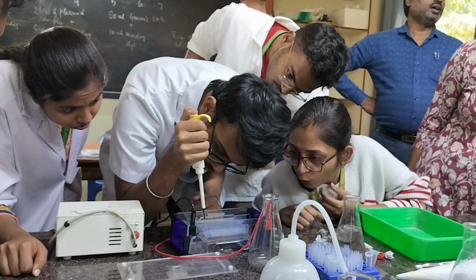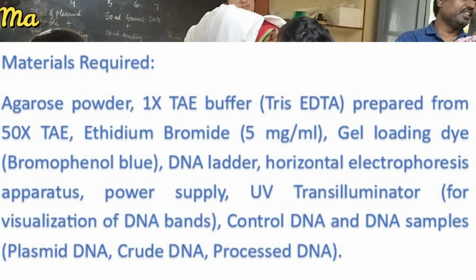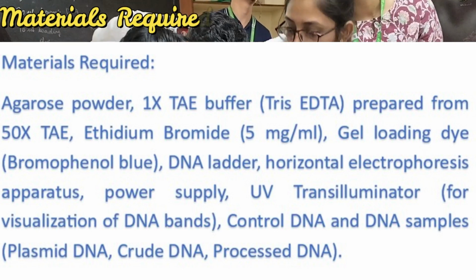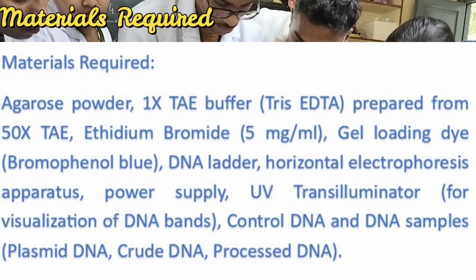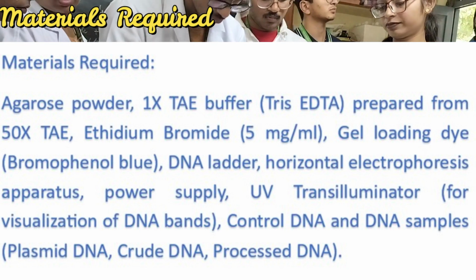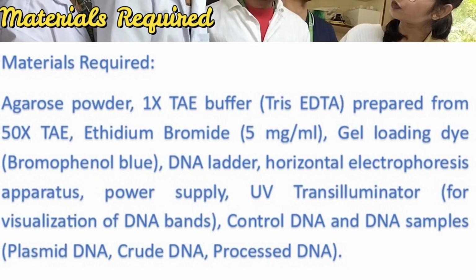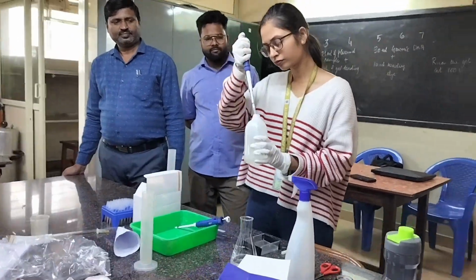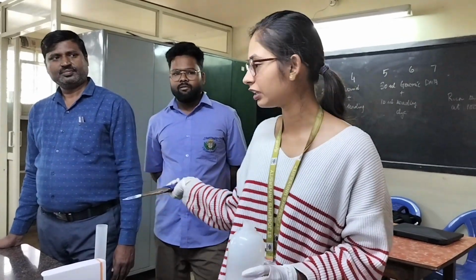Materials required for gel electrophoresis are as follows: agarose powder, TAE buffer, ethidium bromide, DNA ladder, horizontal electrophoresis apparatus, power supply, transilluminator, control DNA, and DNA samples. The protocol for gel electrophoresis. In the first step, we are preparing 1% agarose gel.